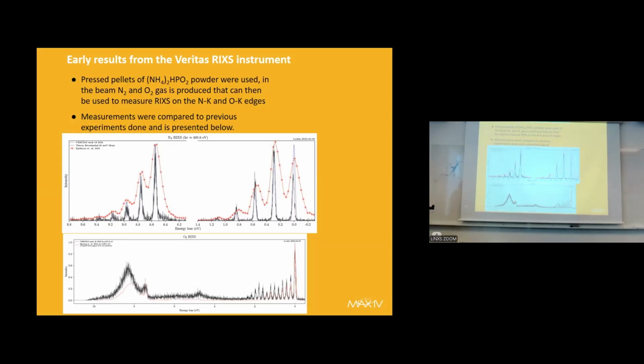And below you see the same spectrum I showed you before, on the O2, with the vibrations excited on top of this pi star in the middle. So you have lots of vibrations there. Just to note something that you can see here: you have something that's dipole forbidden. I mentioned some of them are, but they still show up a little bit. This is something that we took advantage of later. The first Science Advances paper coming out was actually focused on that. I'll show you a little bit of it later.